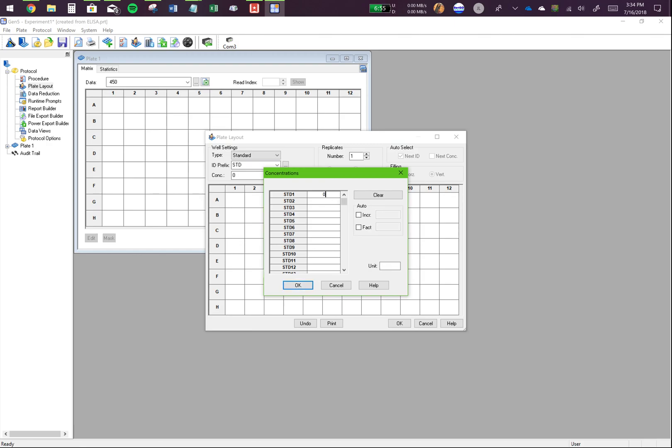Here's where you put your concentration values for the standard if you're running an analyzer. So, let's say my first standard was 1000 nanogram per microliter. Remember, this is only an arbitrary unit. The program actually doesn't care if you put in a unit or not. It's only for your information.